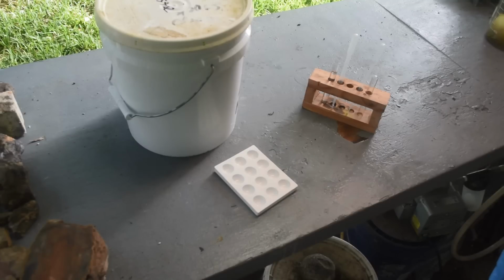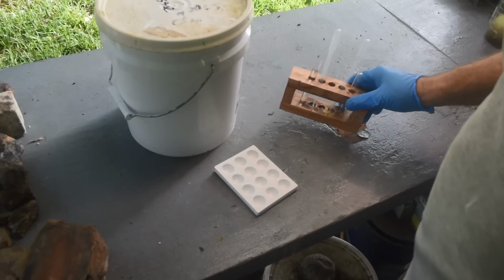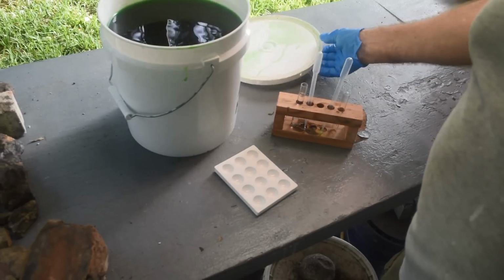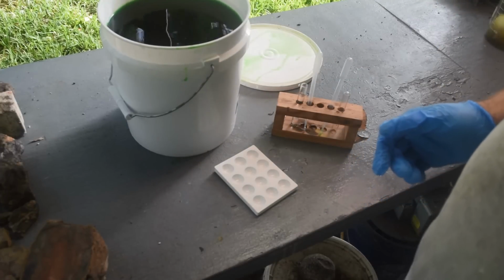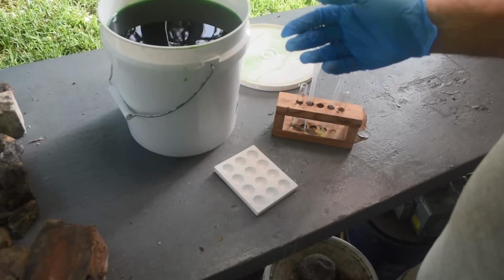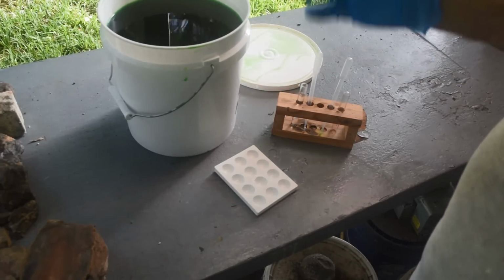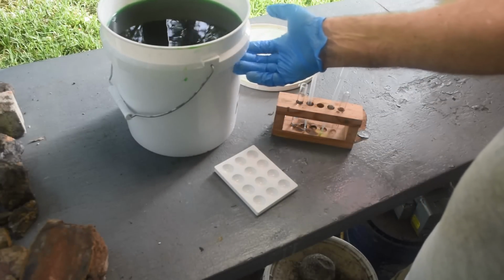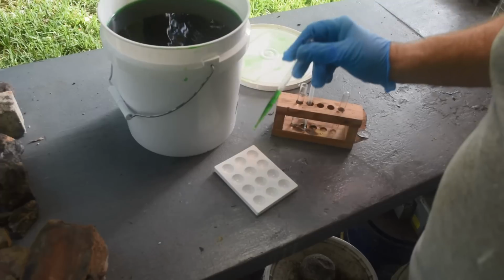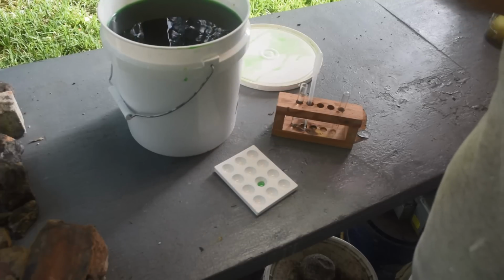All right, so while that stuff's getting the excess liquid pulled out of it under the vacuum filtration, let's have a look at this. Ugh. Got a lot of waste liquid here. We're back to about 2 gallons of waste liquid with all of the rinse water and ammonium chloride water and hydrochloric acid rinse I've used. My goodness, we've got a lot of waste liquid here again. But let's give it a stannous chloride test and see if we've got the palladium out of it. Okay.